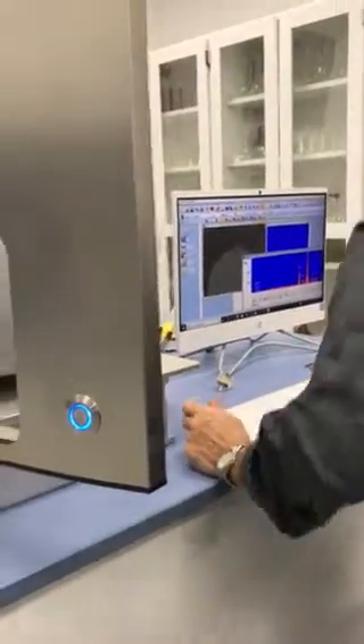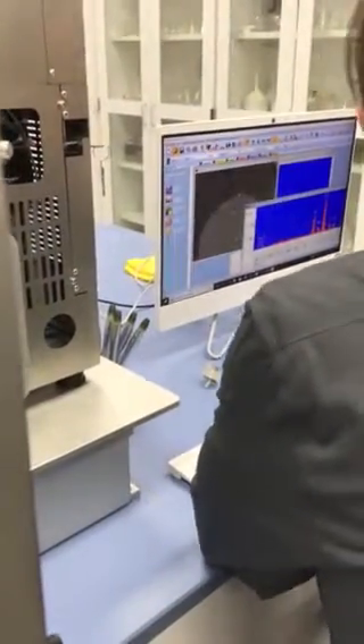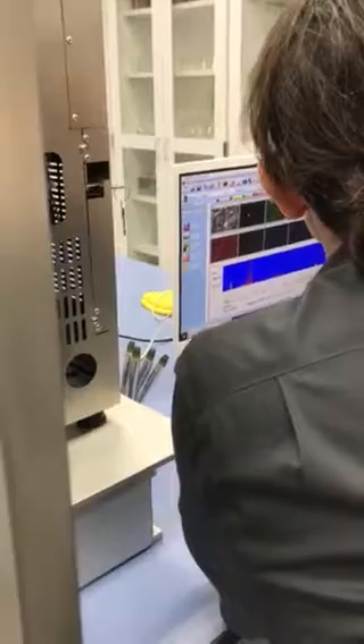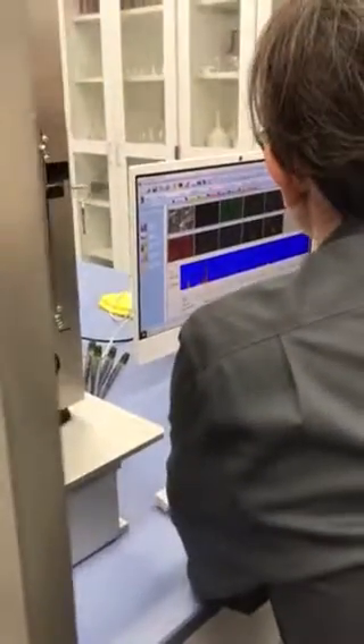Have you guys ever seen anything like this before? Yes, of course. I've sent wires actually to outside labs. So you're getting this type of analysis done — we've got an inclusion and we're trying to figure out what it's made out of. What's really powerful here too is the mapping features. In the mapping feature, you can see the SEM image, and wherever it sees carbon it puts a little orange area, wherever it sees manganese it puts blue, wherever it sees aluminum it's red, calcium, silica — whatever you're looking at. And what's really cool is you can actually pull out further detail from this.